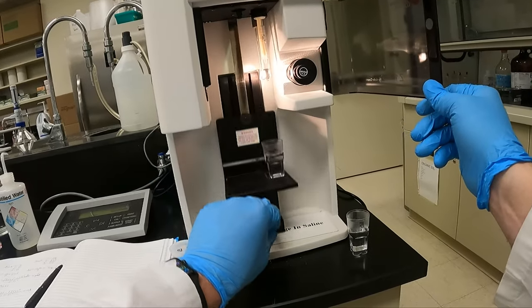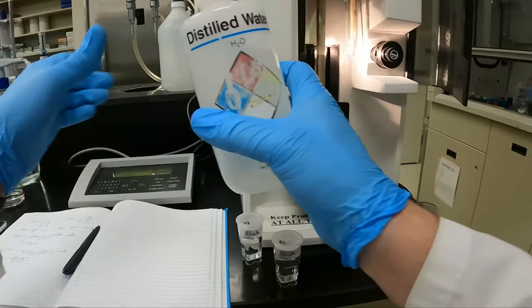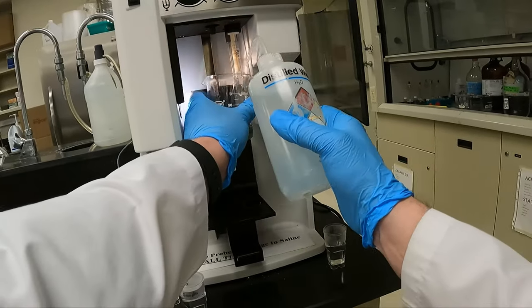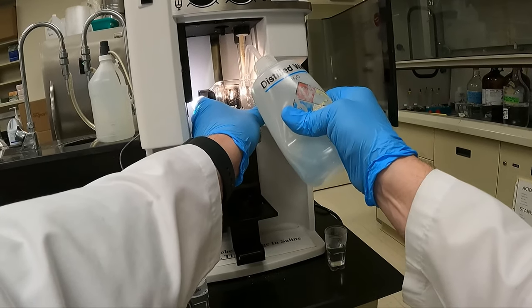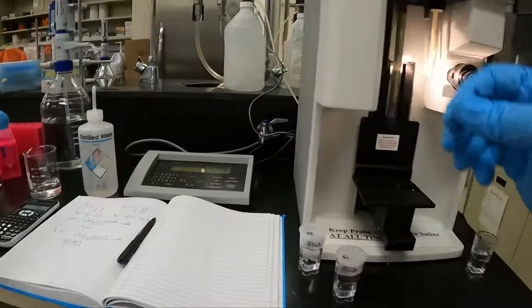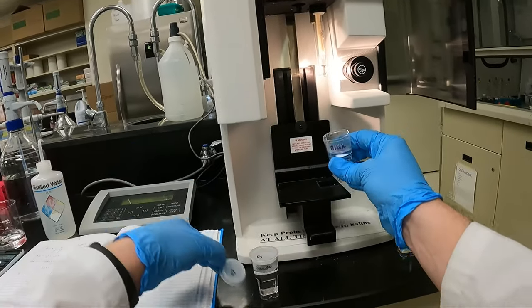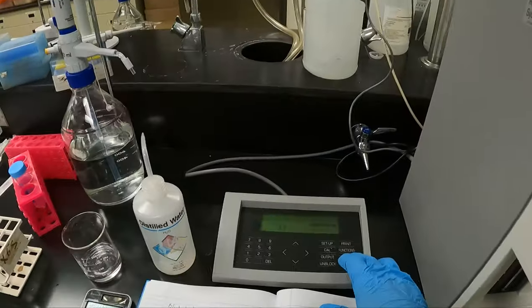When you're done, make sure you clean up your Coulter counter by rinsing with water and running your blank one time. Ensure that you have below 50 for your last count with your blank and record that on the log sheet on top of the Coulter counter.